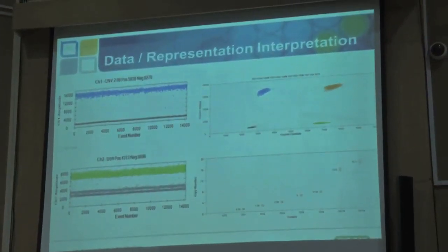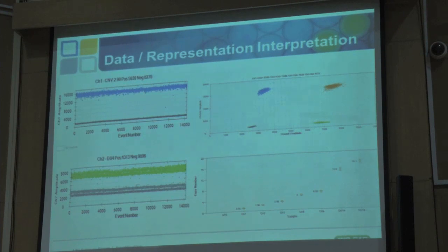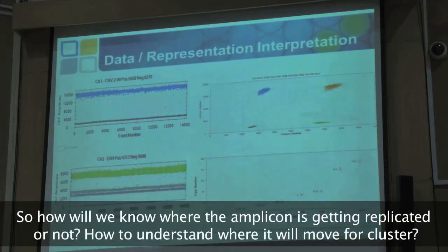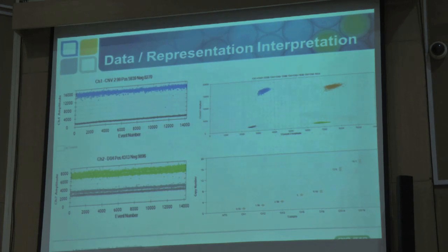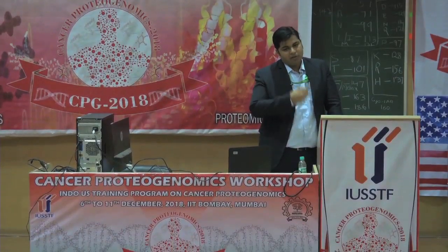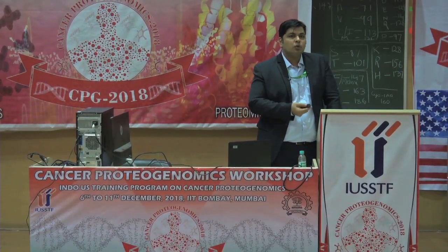If there is non-specific amplification, you would not get a single clean cluster — you would get multiple clusters because the amplicon size would vary. The system is very sensitive to this. A good practice is to run one known standard the first time you set up a new reaction, note which fluorescence amplitude it falls at, and use that as reference. If you see something variable, it means a non-specific product is also amplifying alongside your specific target.